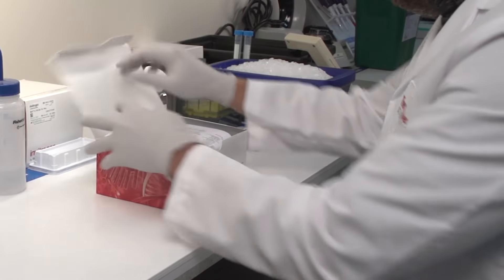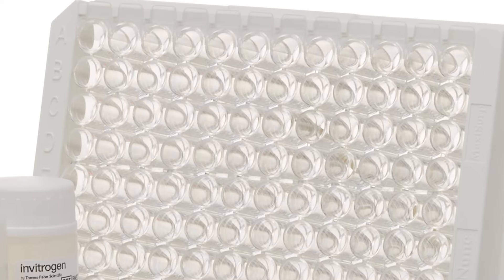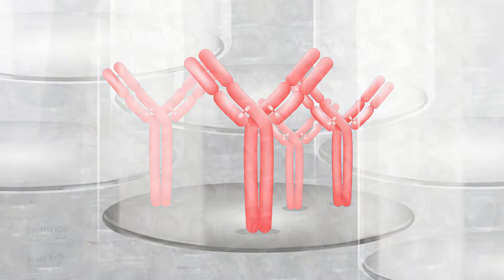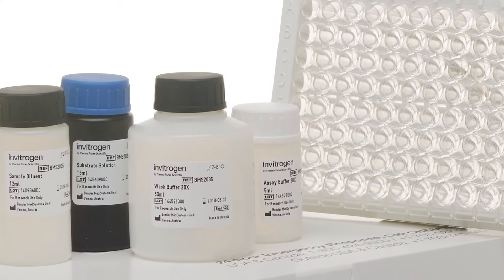Let's start with what comes in your ready-to-use kit. Inside the box, you'll find a pre-coated ELISA plate with the capture antibody already absorbed to the bottom of each well. You'll also find standards and all the needed buffers and reagents to run the assay.